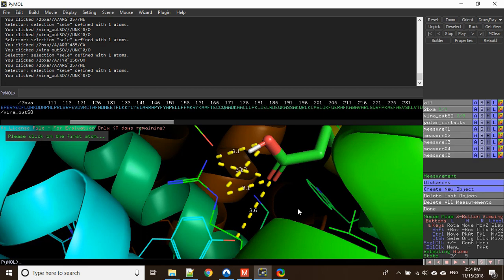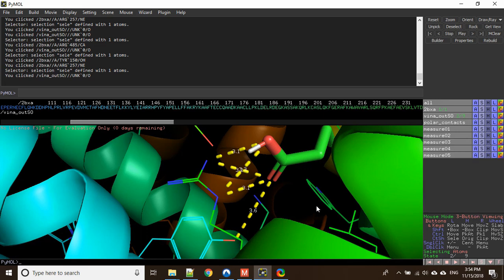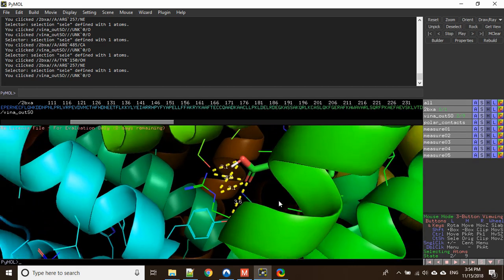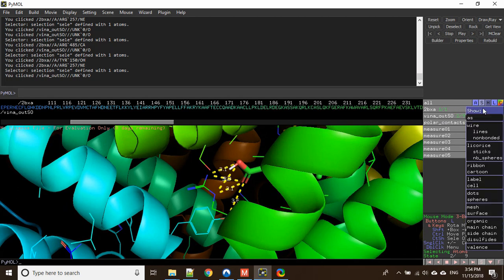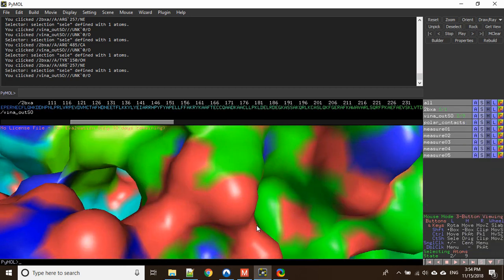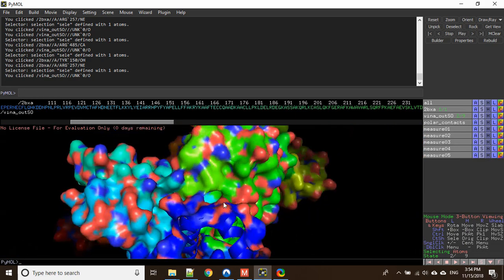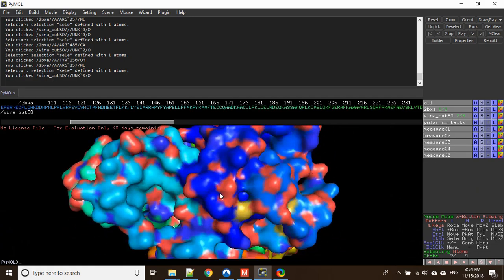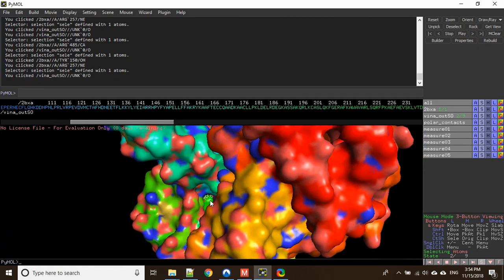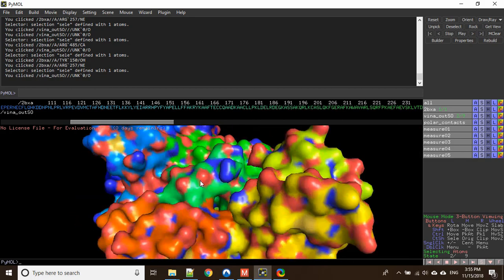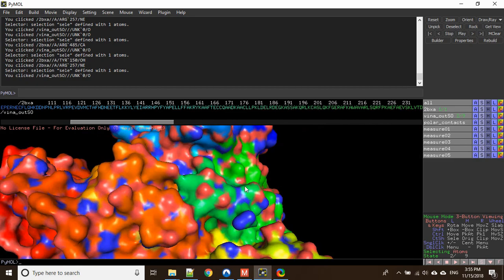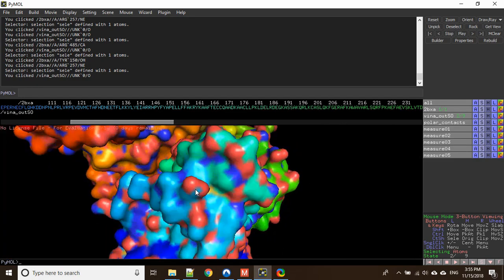If you want to view this ligand in the binding pocket, you need to change your protein appearance. Click on the 'S' tab of 2BXA which is your protein, and show the surface. It will show you the surface. Let's zoom out a little and search for your ligand. The ligand is in that binding pocket. If you want to make it clear, you will have to remove some amino acid residues to analyze the ligand conformation in the binding pocket.